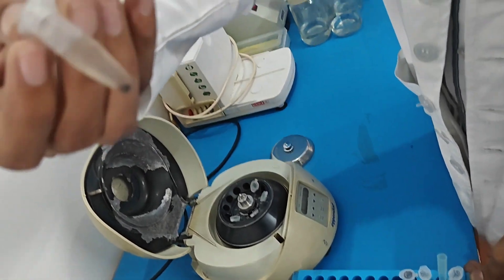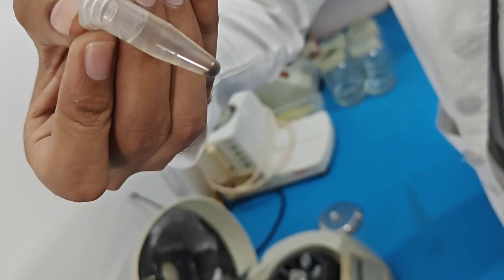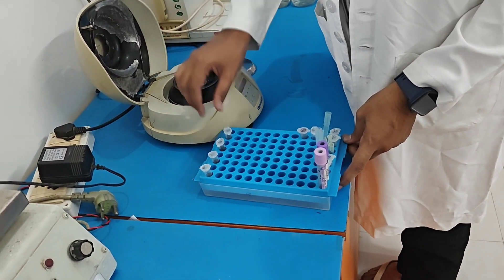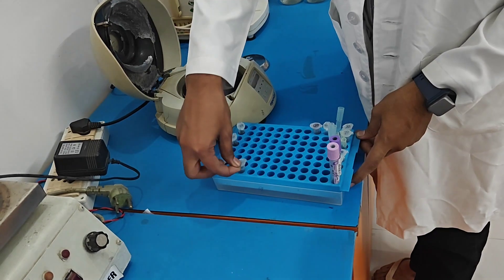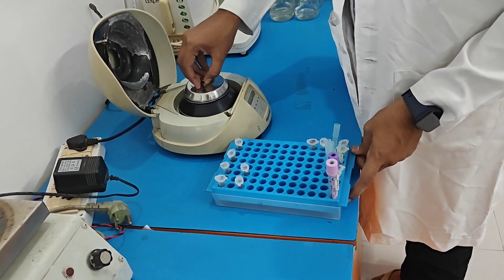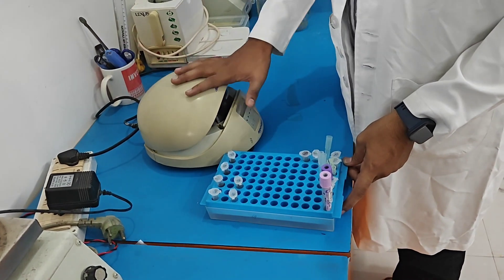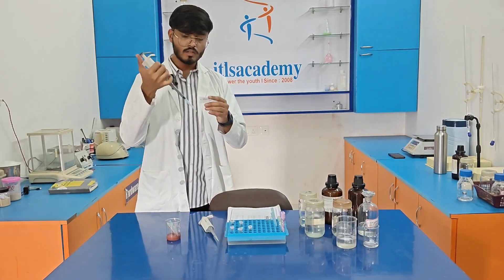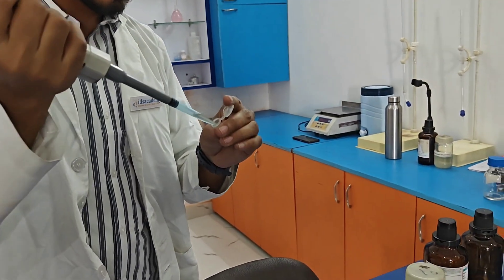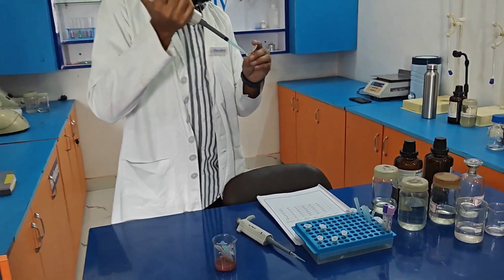After centrifugation, white pellets are observed in the eppendorf. We need to discard the supernatant again. After discarding the supernatant, we need to add 100 µl of 70% ethanol and centrifuge again. We need to discard it very carefully so that the pellets are not discarded.